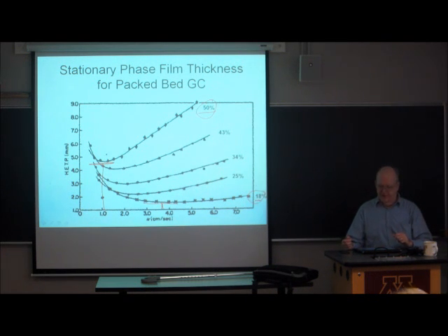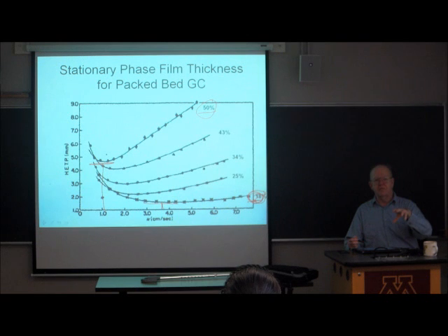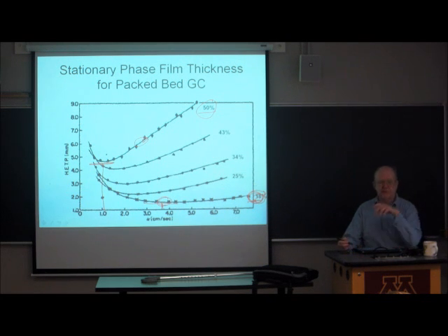And the trade-off, obviously this is better, but since the chemistry is the same, the retention factors here are going to be a lot higher than the retention factors on the 18%. What that means is that you can inject a larger sample onto the 50% loaded particles than onto the 18%. So they don't overload as easily when you've got more stationary phase.